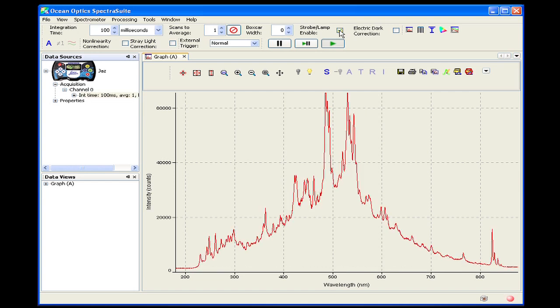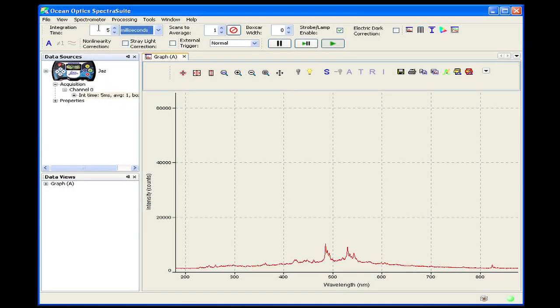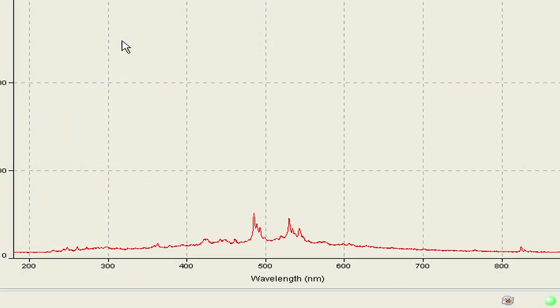Now we'll cover the recommended method of running the Jazz PX in triggered mode with Spectra Suite. In the Data Sources pane, select the current acquisition of the Jazz spectrometer. Then, clicking on the External Trigger drop-down menu, we select External Hardware. The software, spectrometer, and light source are now completely synced, preventing any drop-outs in your spectral data.